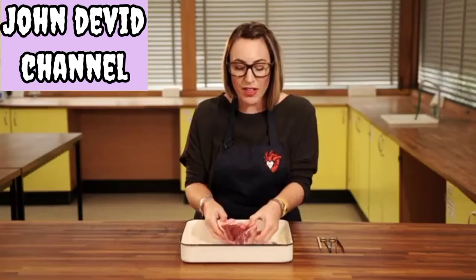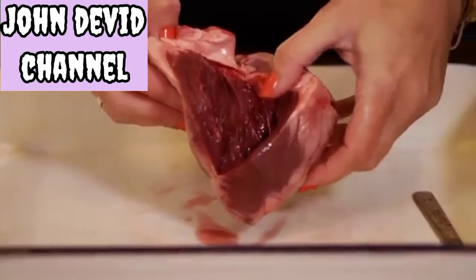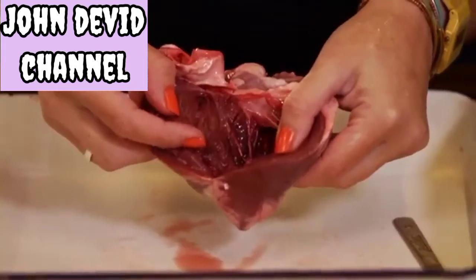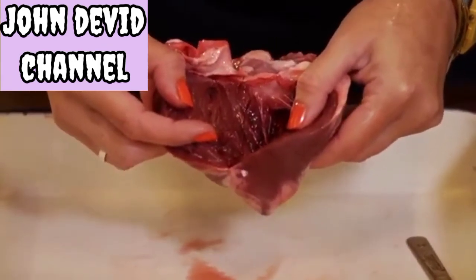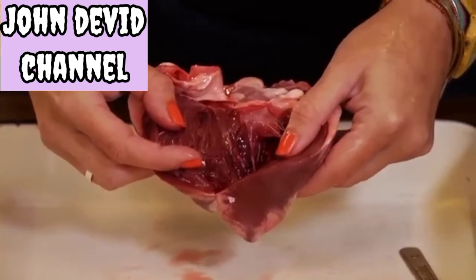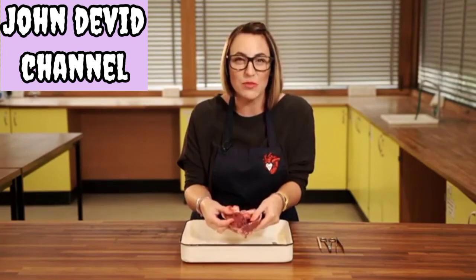You can open a heart like opening the pages of a book and then we can see those internal chambers. You should be able to identify that at the bottom of each side you've got your ventricles — these are the parts that are going to pump and push the blood out of the heart, either to the lungs or to the body. Remember your heart is a double pump: it's pumping to two places at the same time.